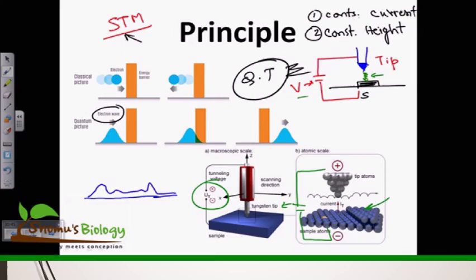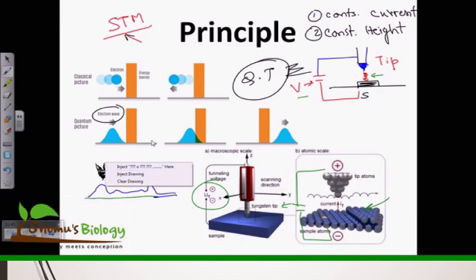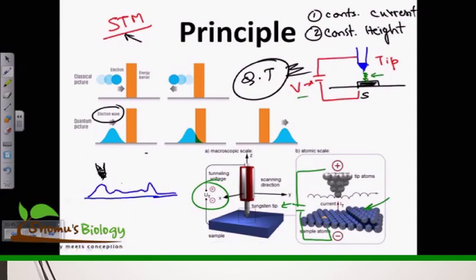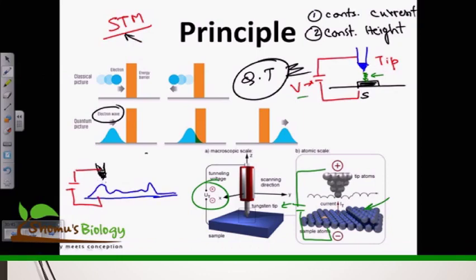The idea in the case of constant current is, let's say we bring this tip here. Say this is the tip, for example a tungsten tip. This tip is providing current because of this voltage gradient, whatever voltage gradient is present, and it is transferring some electrons. So during this process, a particular current will be generated between the tip and the sample's surface.